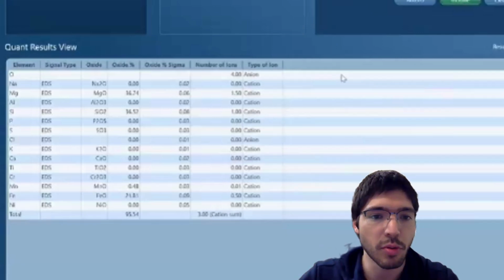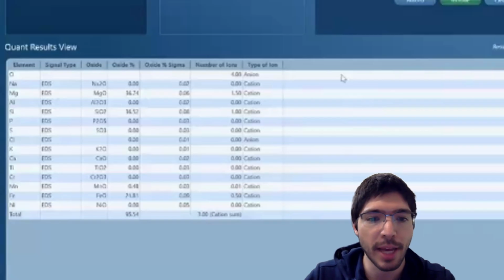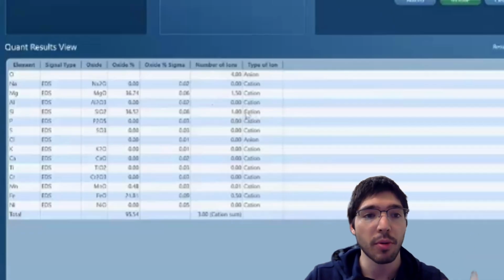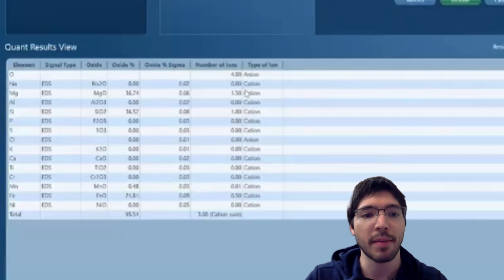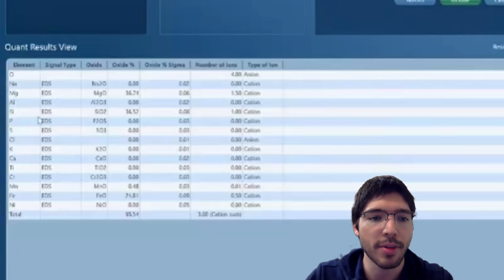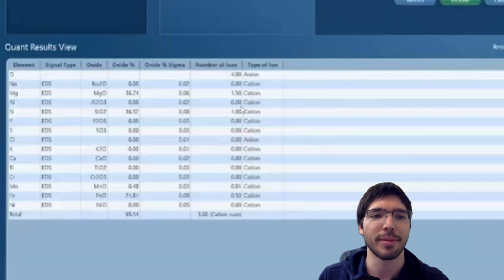So this is just one of the tools that I'm doing. But as you'll see later in the video, and feel free to skip ahead, Topher, and just move back and forth, I'm essentially just exporting images. And then once I get to the point where I will be looking at each of the spectrums that were taken from all the different sites, I'll have to investigate them and do some data cleanup. So at that point, I'll probably have to do a little bit more narration. But in the meantime, always happy to answer questions, and feel free to have any other commentary if need be.